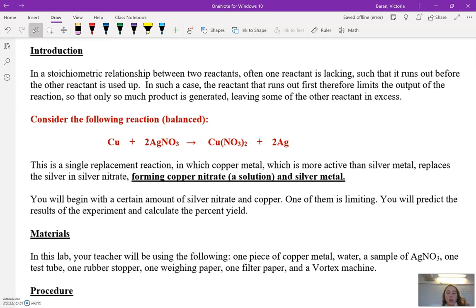Here's the reaction I'm going to be carrying out, and you'll need to refer back to this equation for your calculations. We have copper and silver nitrate, AgNO₃, and we're going to get copper nitrate — which will be in solution — and solid silver, Ag. This is a single replacement reaction in which the copper metal replaces the silver. If you remember from chapter eight last semester, we talked about activity series. In this case, copper replaces silver, silver becomes a solid metal, and copper nitrate dissolves in solution.